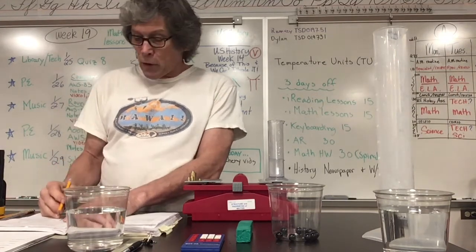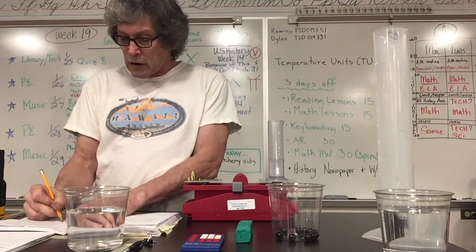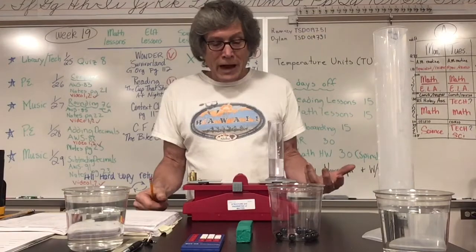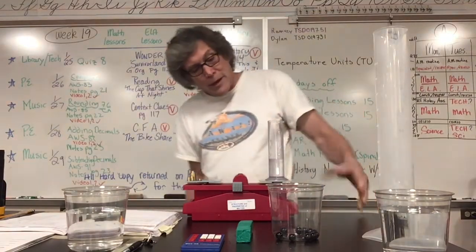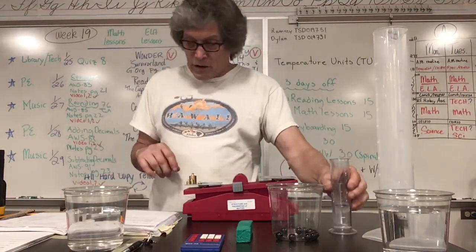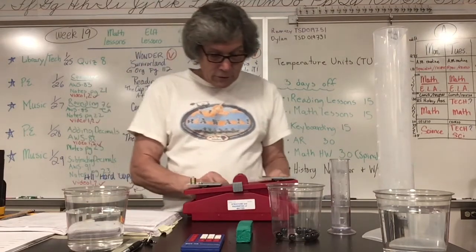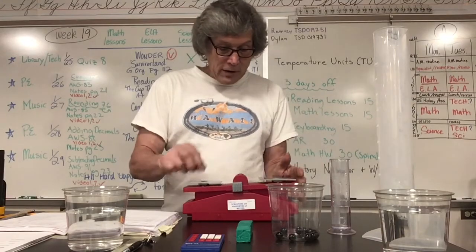So now you might be wondering, why did I take that 36? Well, if you go 96 minus 36, I get about 60 grams. Okay? This stuff isn't real accurate, I admit. But hey, that's as close as we're going to get with school stuff. And normally, water would be very close to both the grams and the milliliters are usually about the same. Okay, but I'm going with what I found, you know.